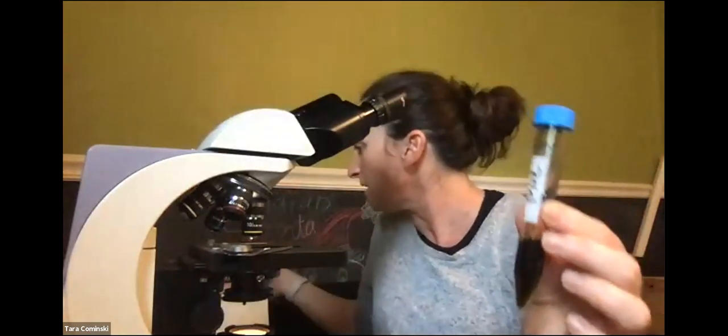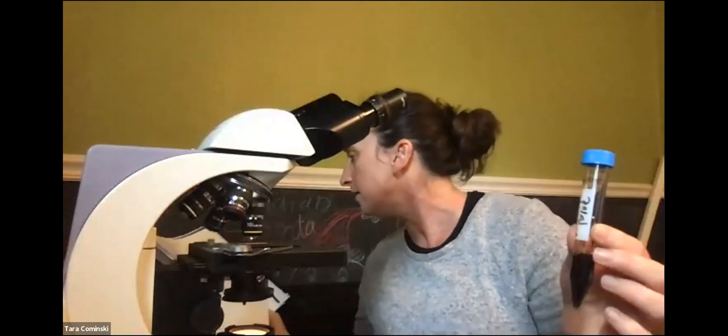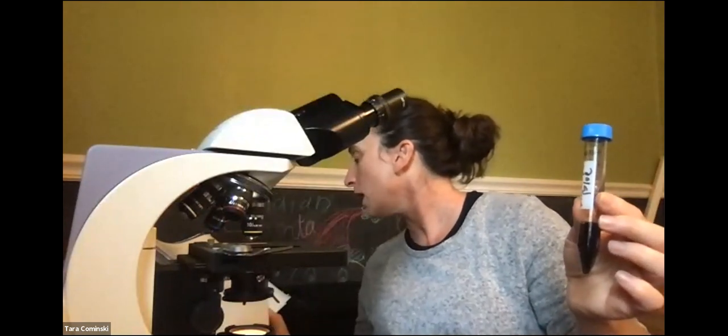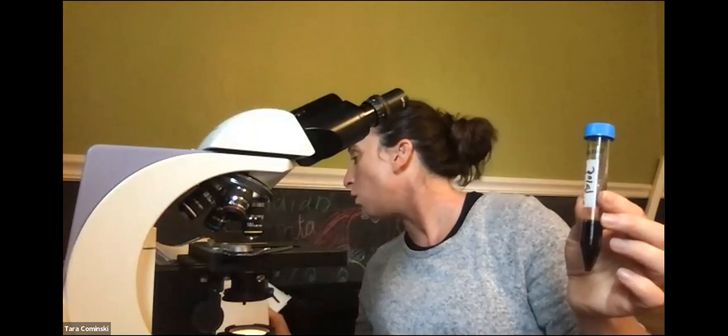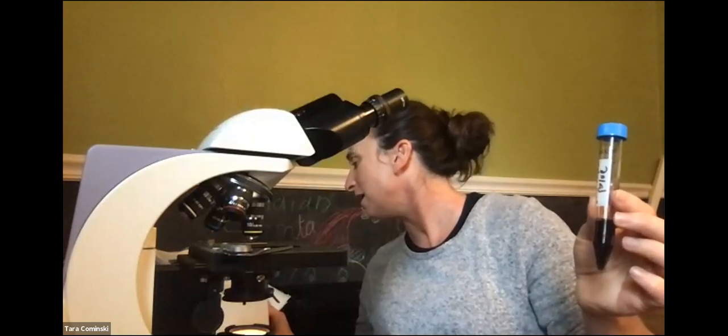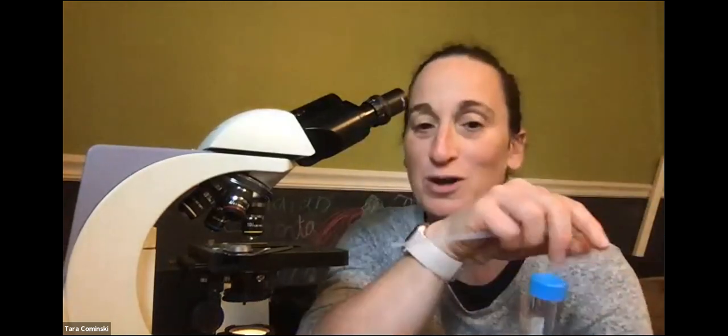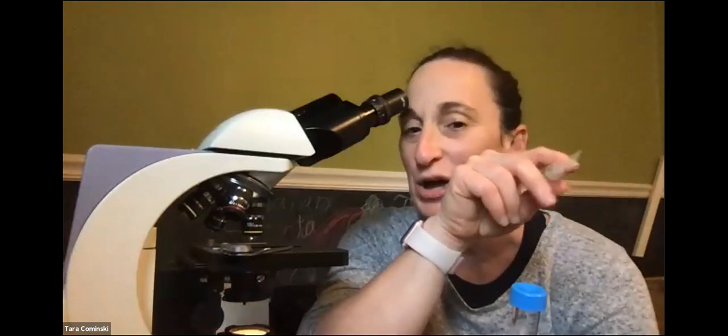I think that's what they asked. They told you can use iodine, right? Oh, methylene blue. Oh, crud. I think I took the wrong thing. Why did I do that? Anyway, usually you can, yeah, I don't know why I just use this. This is not what you should use, but let's see if it works. I think I thought I took methylene blue.